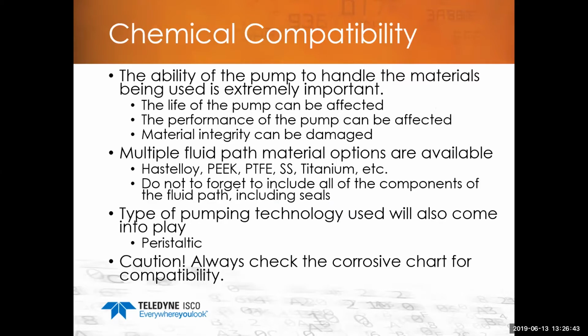Chemical compatibility. So when you look at the three different types of technologies that we talked about, and we're going to focus in, we won't focus so much on diaphragm, but let's talk about syringe, reciprocating, and peristaltic. Chemical compatibility is very, very important. You do not want a chemical inside the syringe of a syringe pump that's eating away the syringe, especially at the pressures you can get to there. That's a very dangerous situation. The same goes for peristaltic pumps, with the hose getting eaten away by the material you're using. If you're not using the correct hose material, so you really need to understand and consider the chemical compatibility of the material you're using versus the material you're pumping.